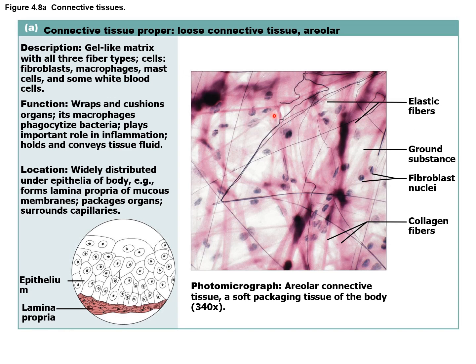This is areolar connective tissue proper. It's loose, which means the cells are free to navigate through this connective tissue. You'll see the nuclei of cells scattered throughout, a lot of collagen in pink for some strength. This tissue is found head to toe in many places in the body. It wraps around organs or packages organs, and it's also under your skin layer or under epithelium.